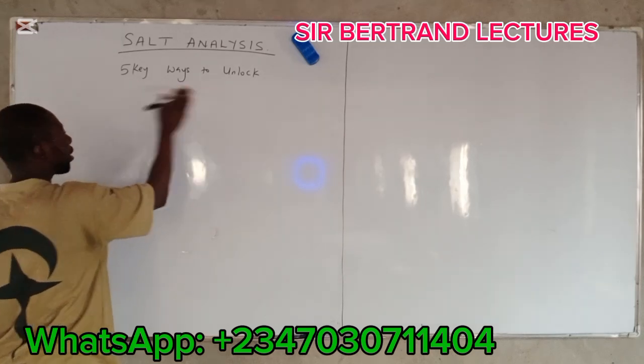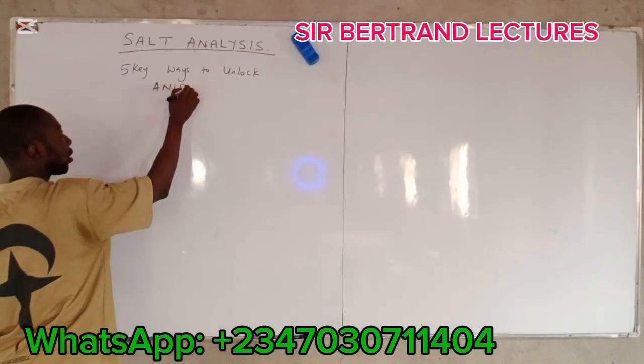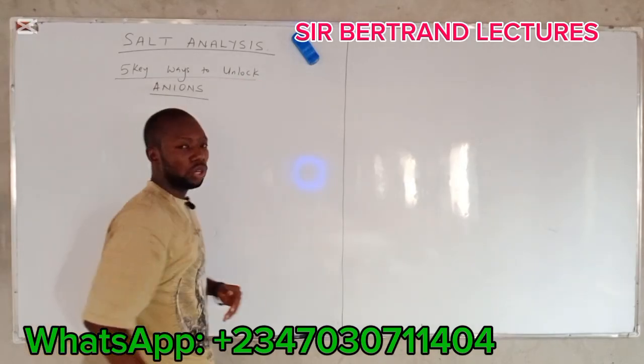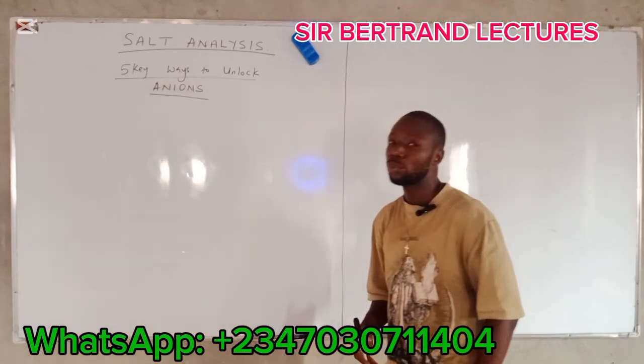Let me write it in capital letters. The five key ways to unlock anions in a given salt sample.